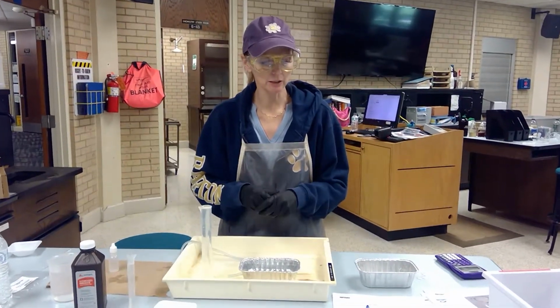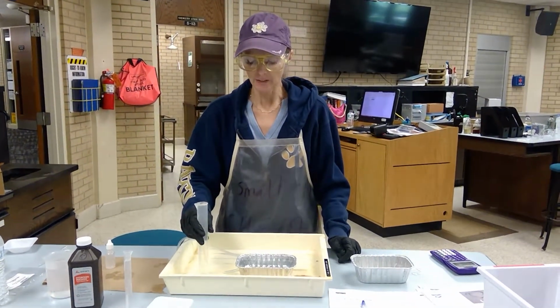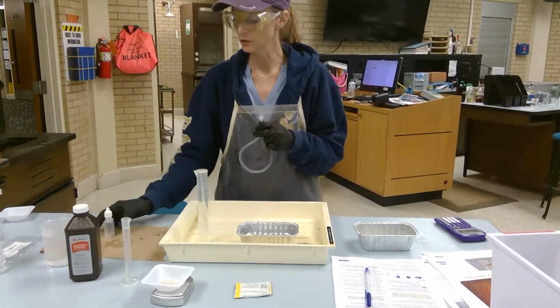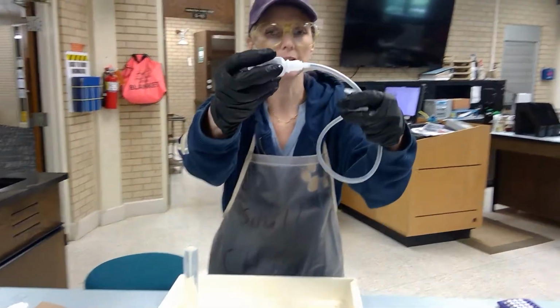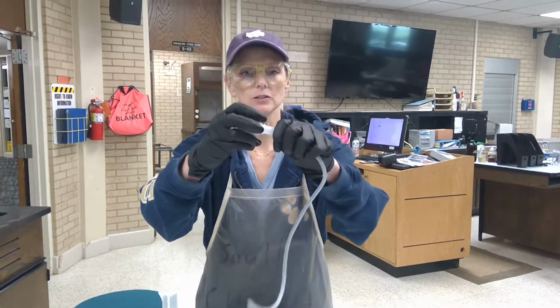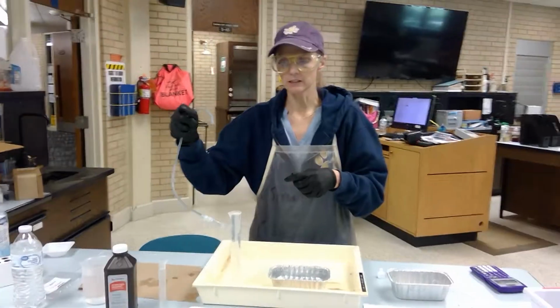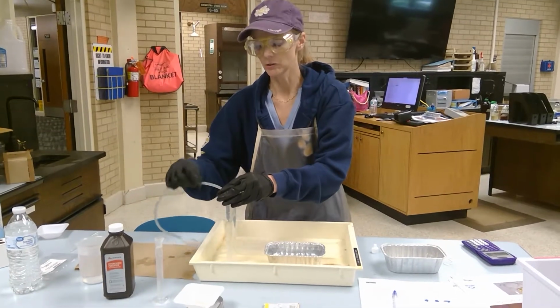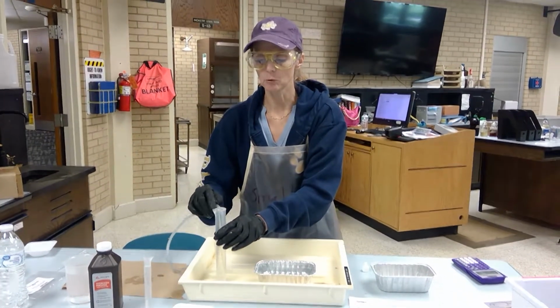So to do this experiment, you're going to pre-weigh your graduated cylinder, and then you're going to attach one end of the tube to your dropper bottle. So it looks something like this. These instructions are well written in the activity. So you're going to do this. Okay. Then you're going to stick the other end of the tube in the 50 mL graduated cylinder, and you're going to insert it. Now you want to put your tubing where the pour spout is.